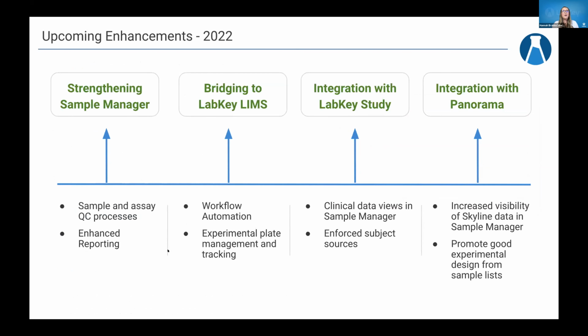And then, for next year, we've got a lot of big plans. I'm really, really excited about it. We're going in a few different directions here. And our primary goal really is to strengthen Sample Manager and continue to make this the most intuitive, most easy to use application for sample and freezer management out there.